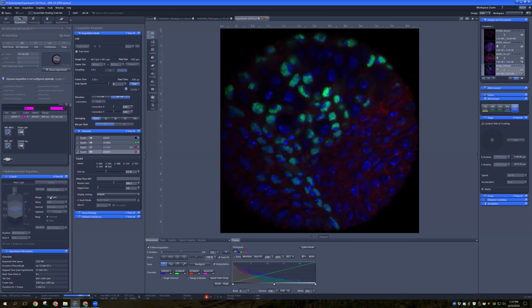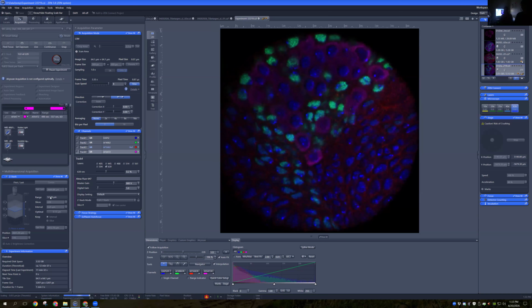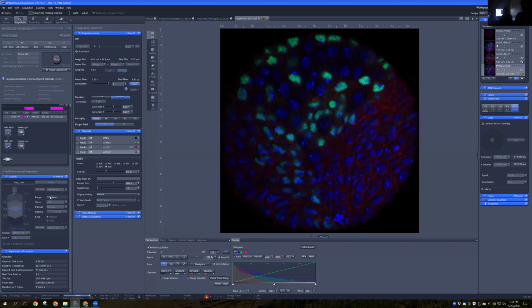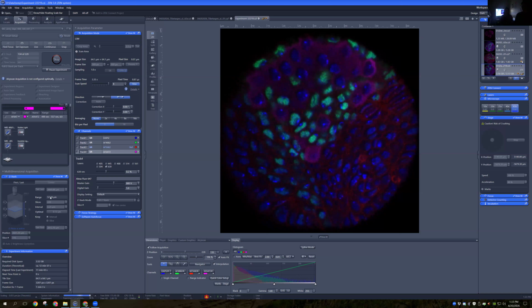It was a very long process, and I'll be very honest, there was a lot of doubt. I think, is this the right approach to a PhD? I'm not getting any data, I'm just sitting here destroying ovaries. It was a very long investment, but more than anything, it is just practice.